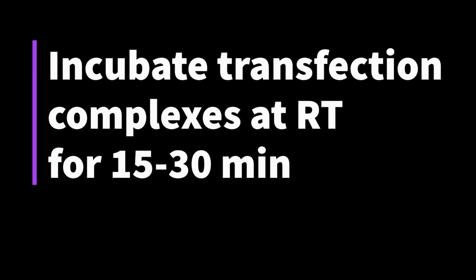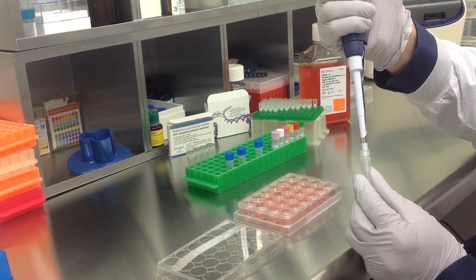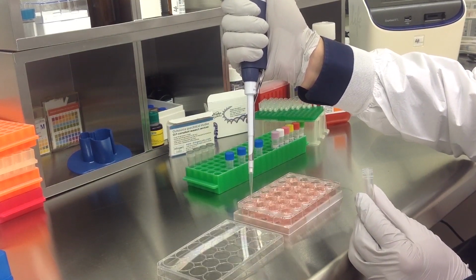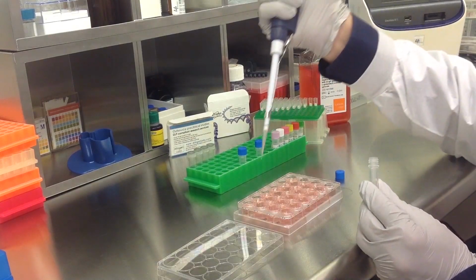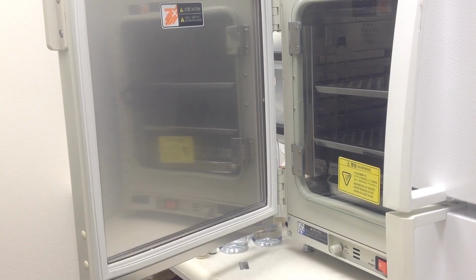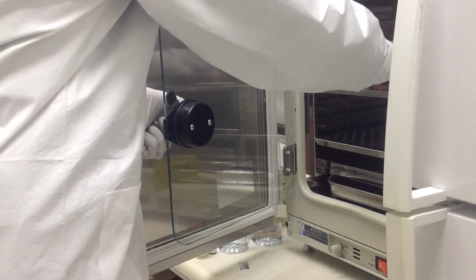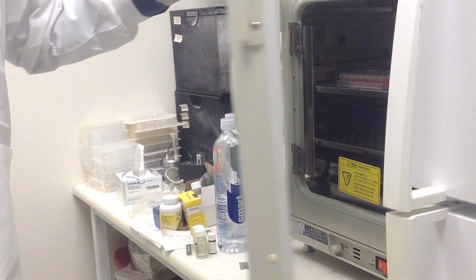Incubate the prepared transfection complexes at room temperature for 15 to 30 minutes. Add the prepared transfection complexes to the 500 microliters of complete growth medium. Once you have treated all appropriate samples, incubate the cells at 37 degrees Celsius in a humidified carbon dioxide incubator. Assay for phenotype or target gene expression 48 to 72 hours post-transfection.